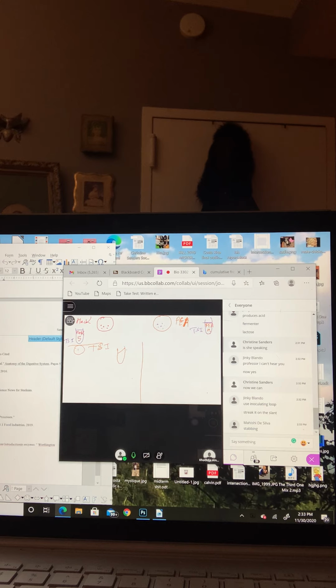Okay. Good. So after this, you have to incubate your tubes. After incubation, you can get three things. What are the three pieces of information that you get from your TSI tube? First, what you can see here, and how you read your tube.